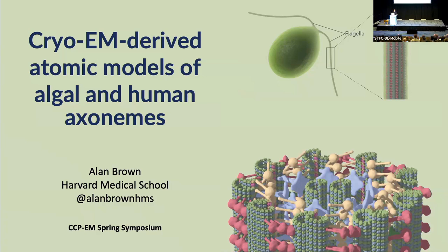I'd like to just start by thanking the organizers, not only for inviting me, but for putting together this really innovative program that combines facility users, method users, and also method developers. And today I want to tell you about our work using Cryo-EM to build models of axonemes.